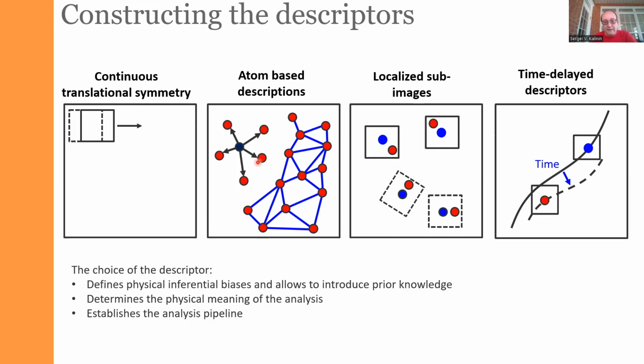The problem with this approach is that microscopy images, whether electron microscopy or scanning probe microscopy or what not, contain a lot of information that cannot be reduced to just atomic positions. For example, they have rich information in the shape of the atomic columns. If an atomic column goes zigzag in the beam direction, this column will look like an ellipse. Very often we have shadow information because of interstitials, distortions, and so on.